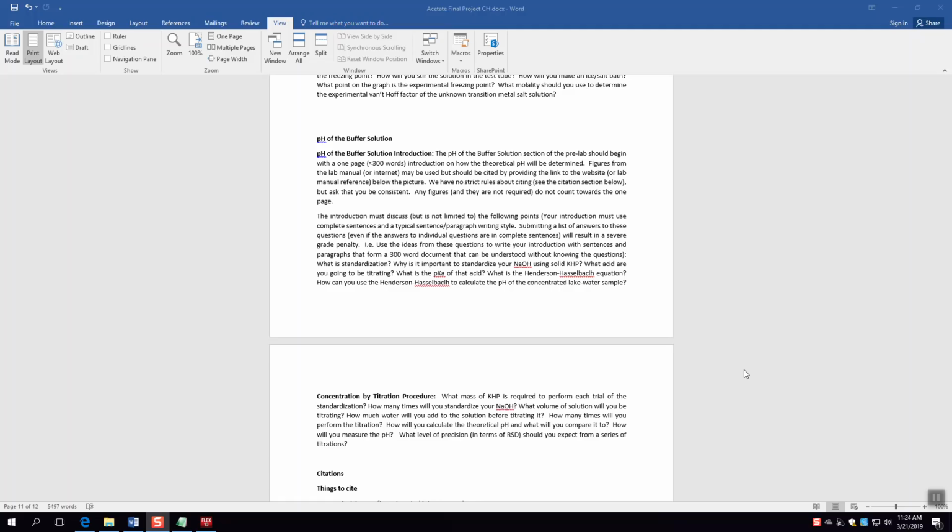Now, you are doing the buffer experiment basically 1 week before you start doing this experiment. It's the same. I mean, you're essentially doing the exact same thing. So I want to talk a little bit about the experimental procedure first, and then I'll talk a little bit about the introduction and the hypothesis.